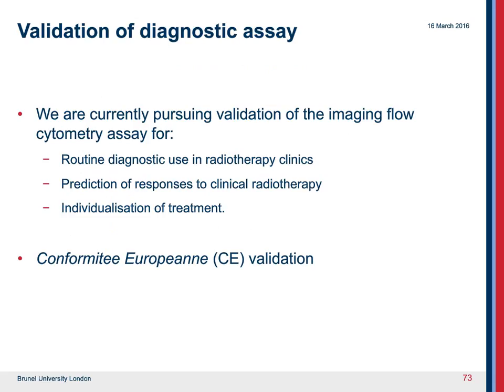So the next thing is to validate this test. And we have to go through something in Europe called Conformity European Validation. That meets a very strict set of conditions which will allow us to use this in a diagnostic setting. So the idea is that we can use this in routine radiotherapy clinics for the prediction of response to clinical radiotherapy, and hopefully individualize treatment on a patient-by-patient basis.